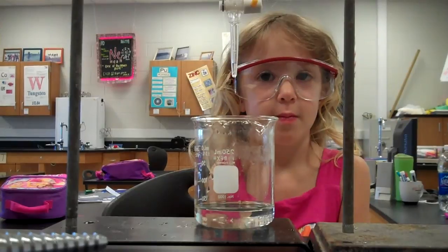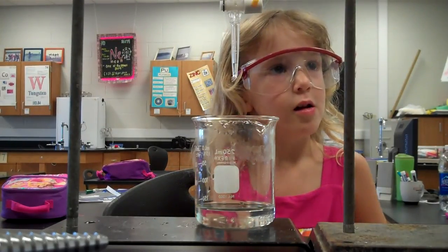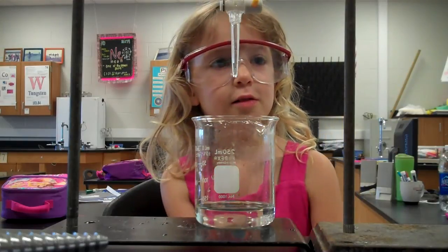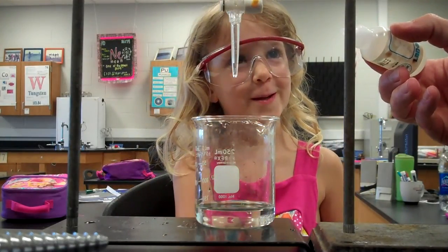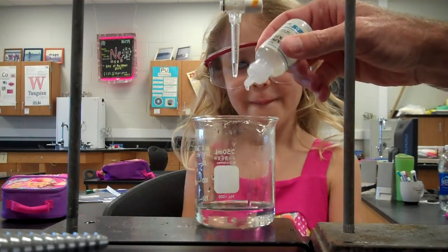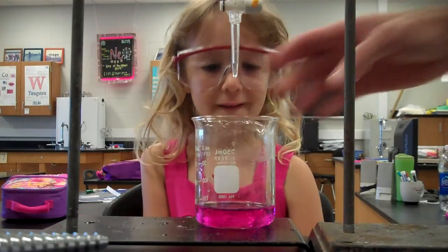What we're about to do is called titration. What color is that going to turn when I put the phenolphthalein in there? Pink. That's right, it's going to turn pink. You don't need much — only one drop for it to turn pink.